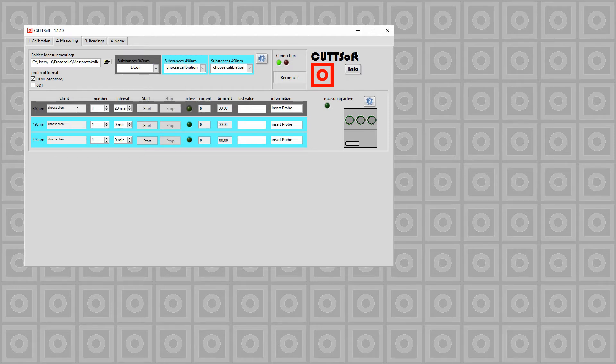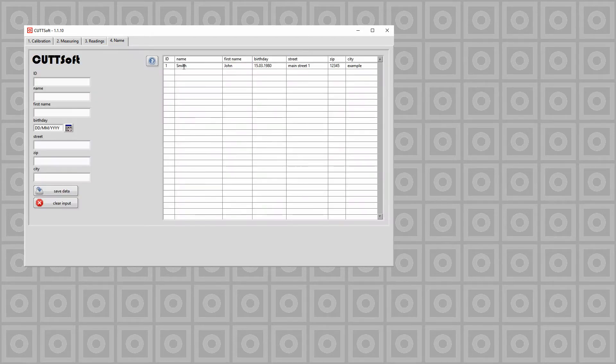Next we have to choose our client. In this case, right clicking on the name and use for channel 1.